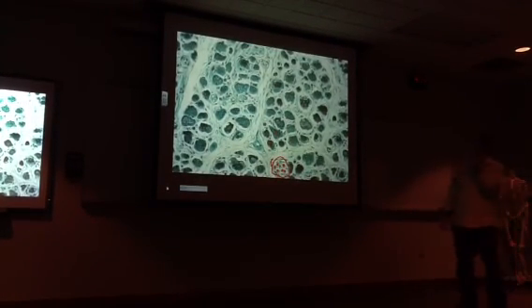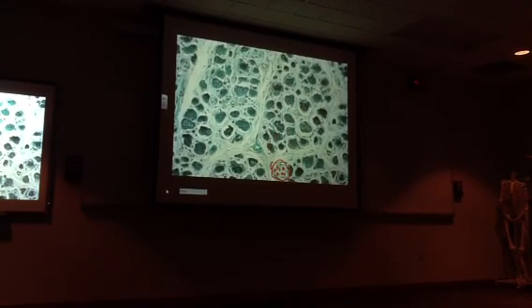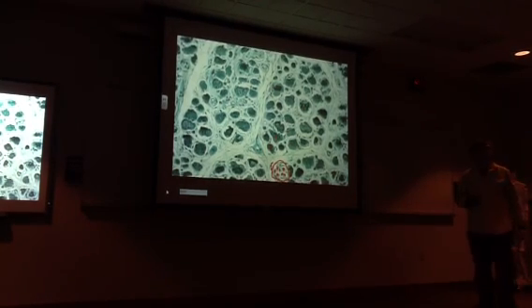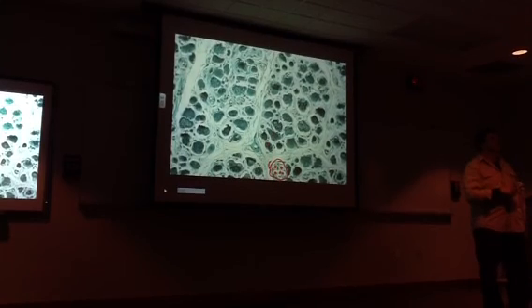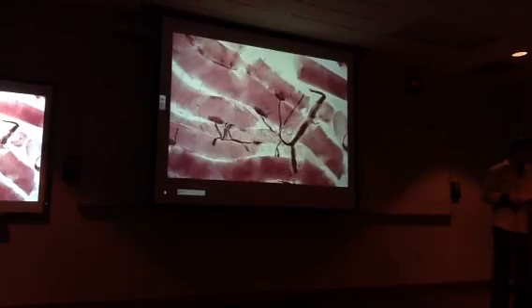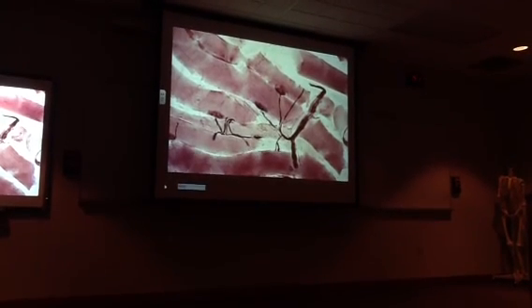Okay, Dr. Scalco's interesting story is this came from someone that was electrocuted. Okay, and the interesting story is it was someone that was executed probably in the 1950s, and they donated their remains to science. I don't know if that's true. I don't know if that's why the tissue looks so horrible, but he insists that it's true. Okay, and he's probably right.